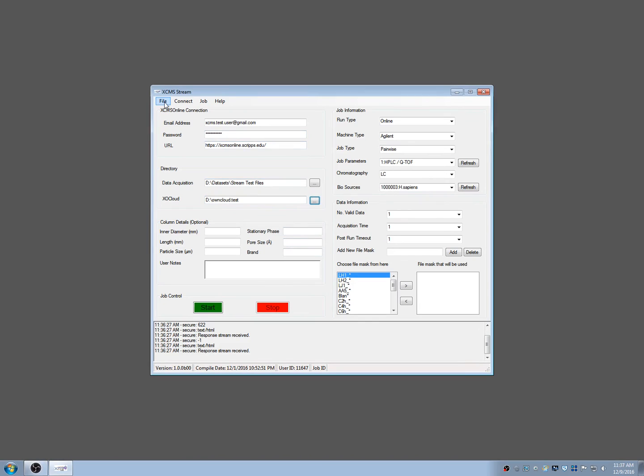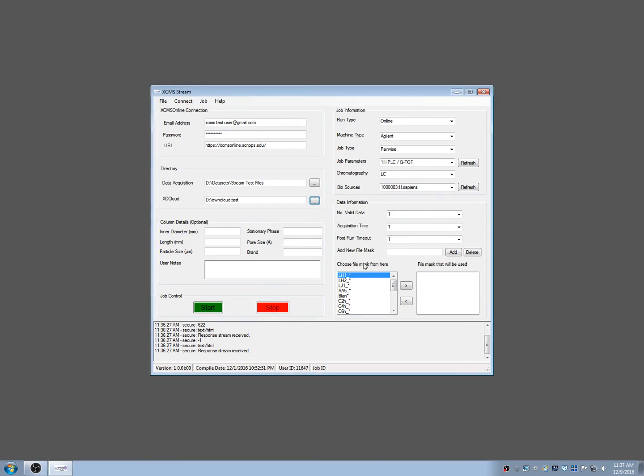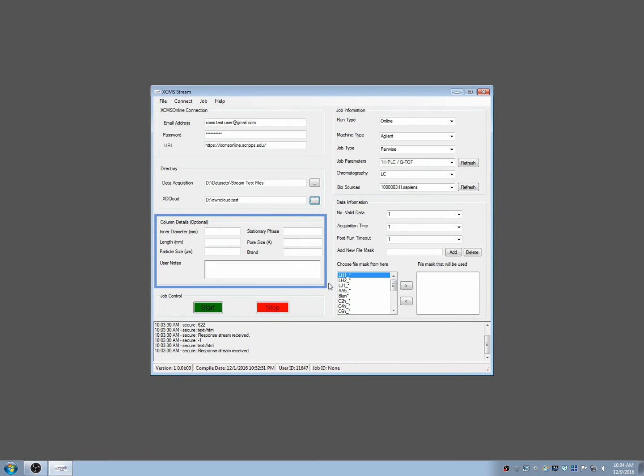Clicking File then Save Settings from the menu bar saves your current configuration, which will load the next time you launch XCMS Stream. The next section, Column Details, are optional, but we encourage you to use them to keep track of experimental settings.